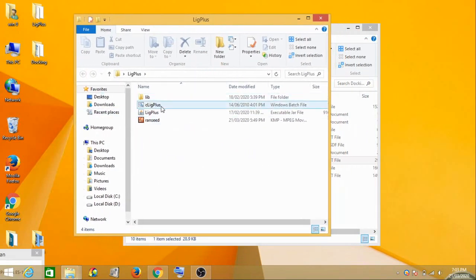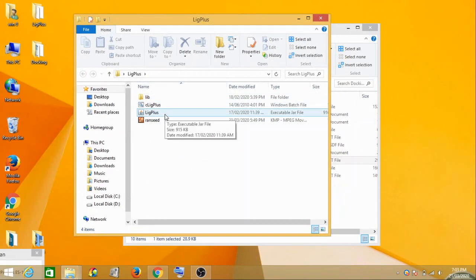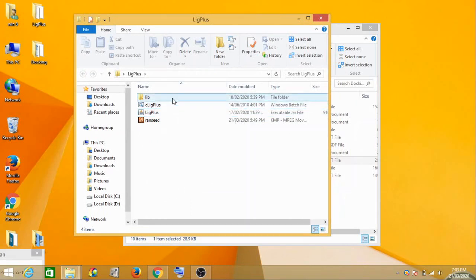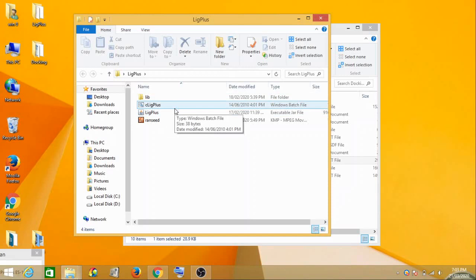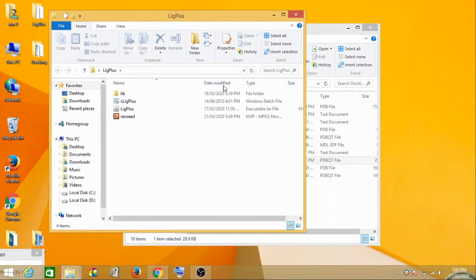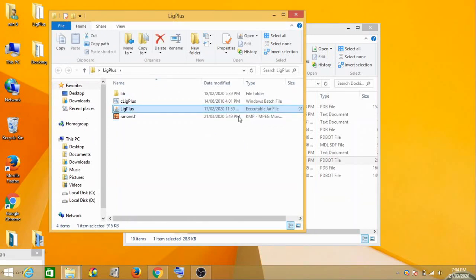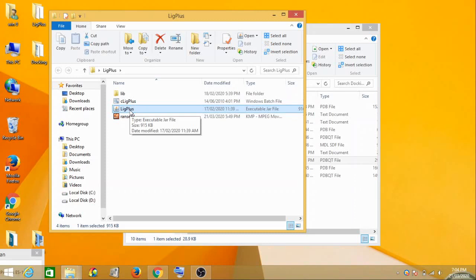You can download the LigPlus and a zip folder will be downloaded from the LigPlus site. You can unzip this folder, and when you open it you will see this LigPlus executable file, this jar executable file. You can double-click on it.